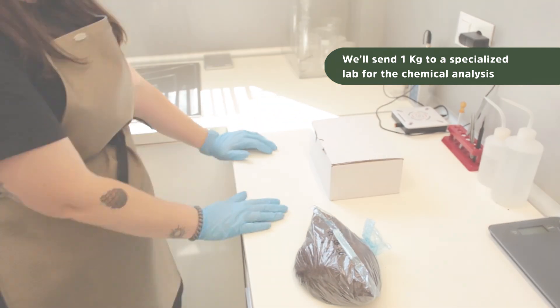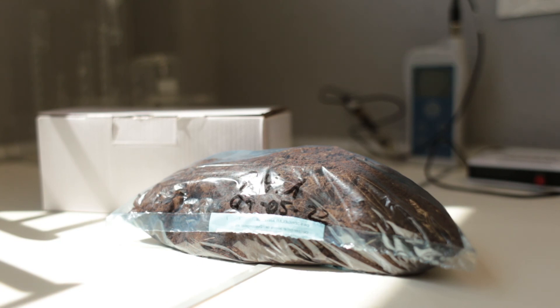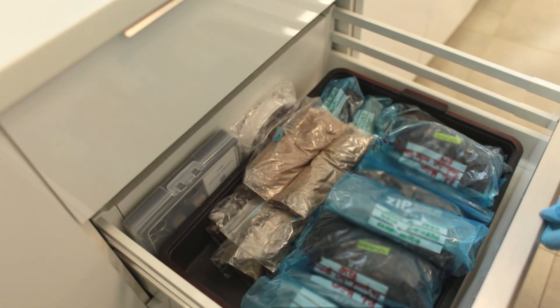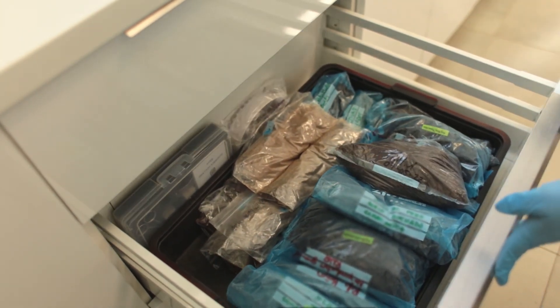And that's it. Remember to label everything correctly so that we can understand which plot the results belong to. If you have any doubts, just get in touch with us and we'll try to solve it. Have a very good day.